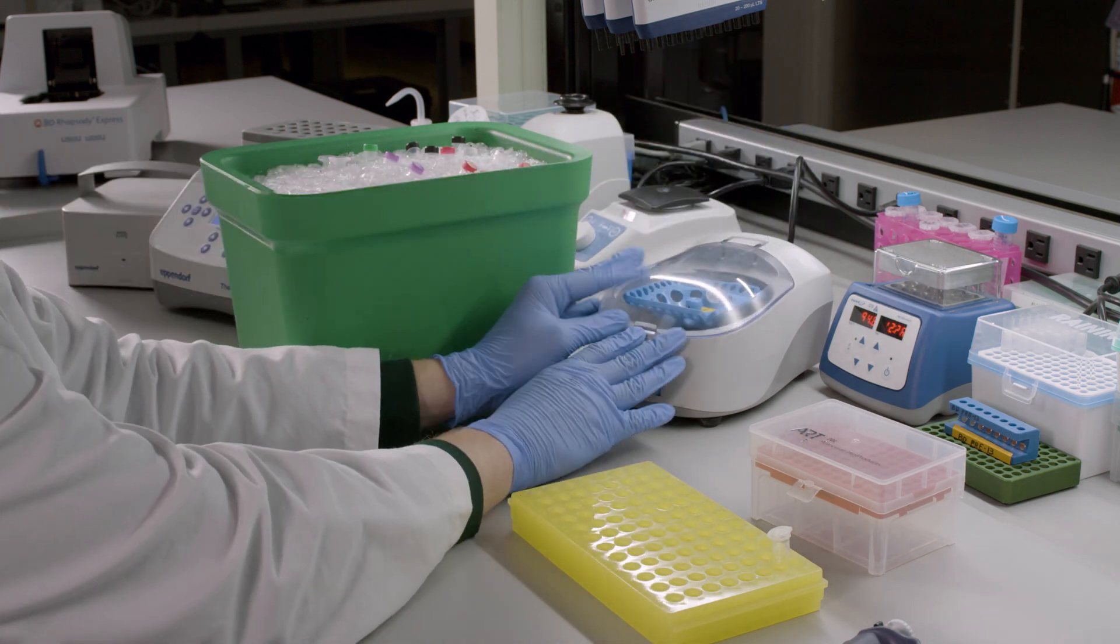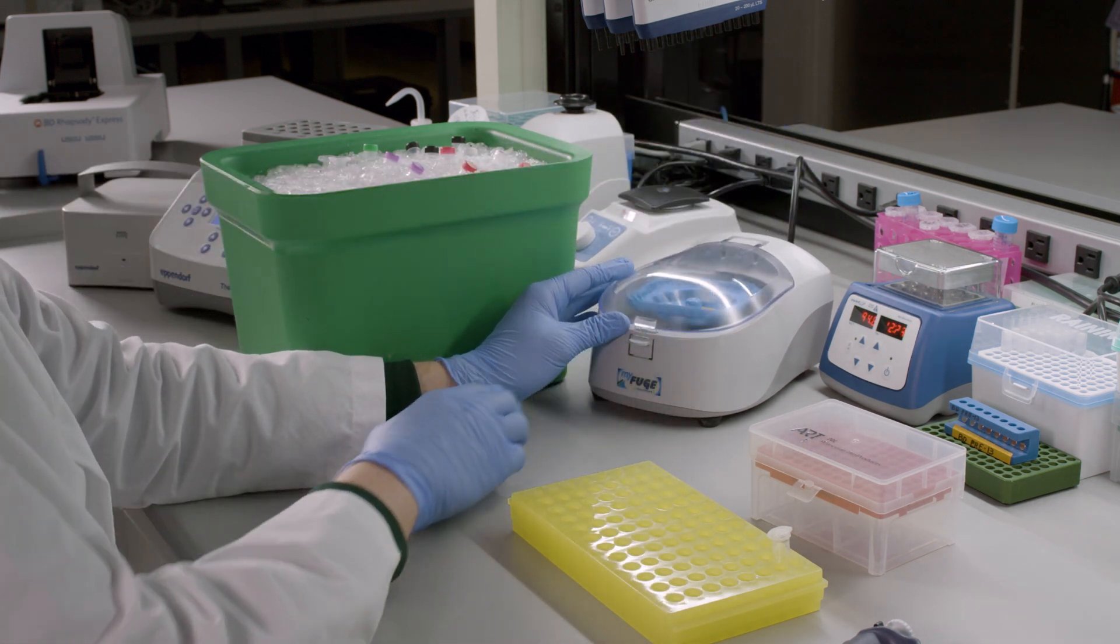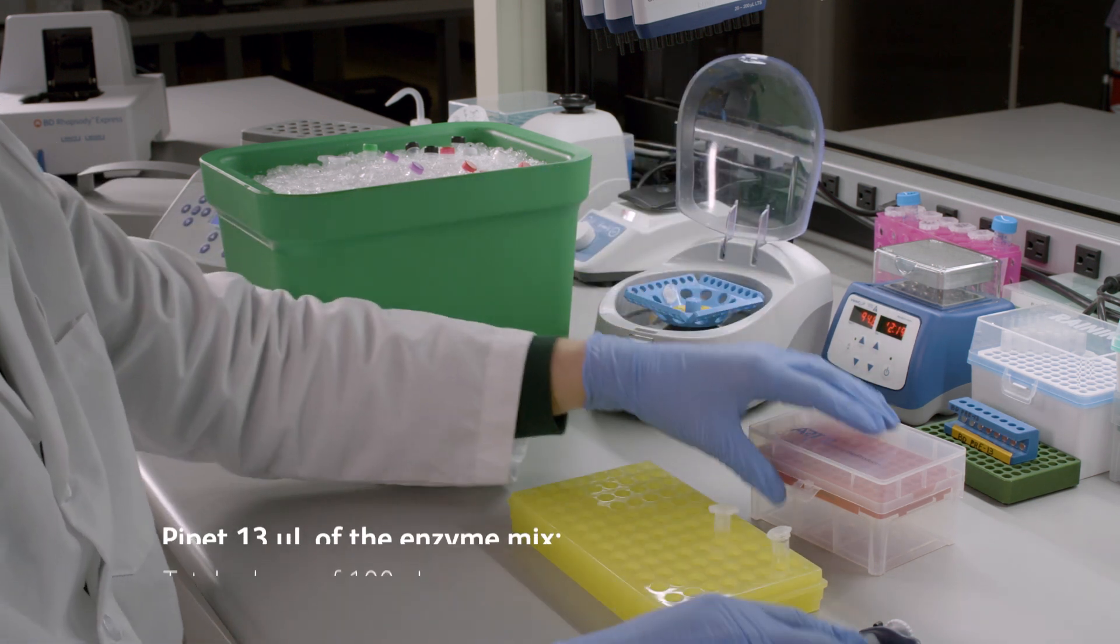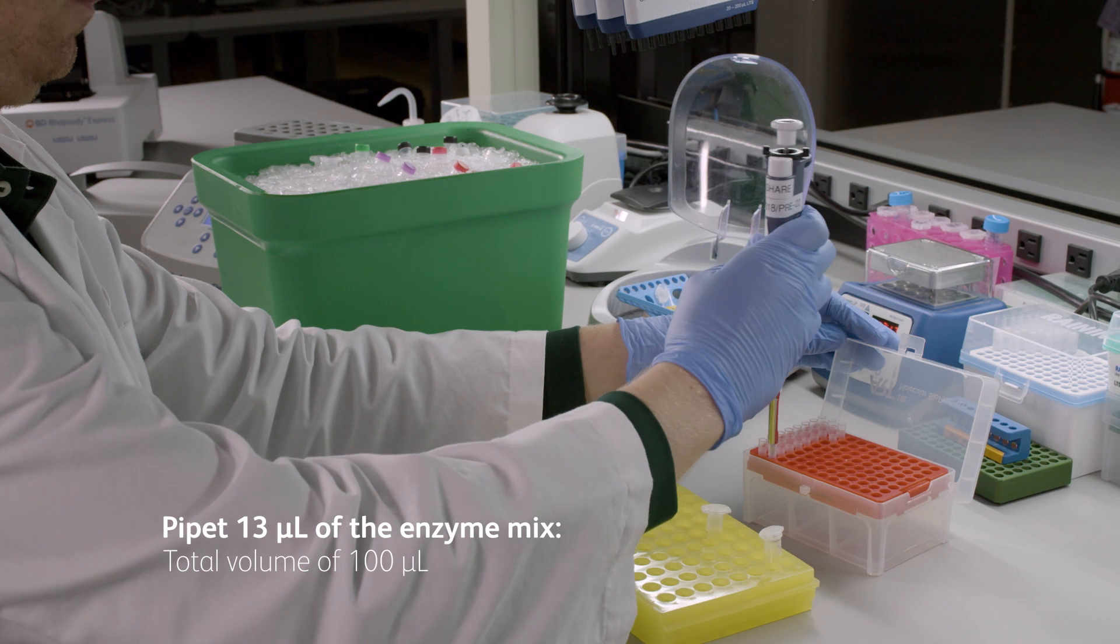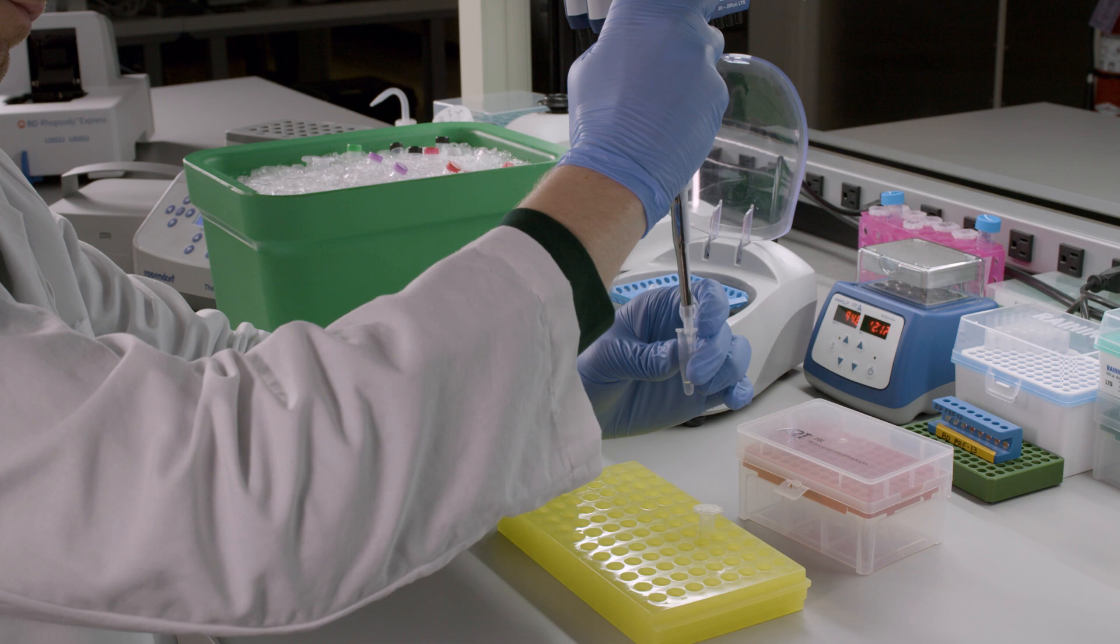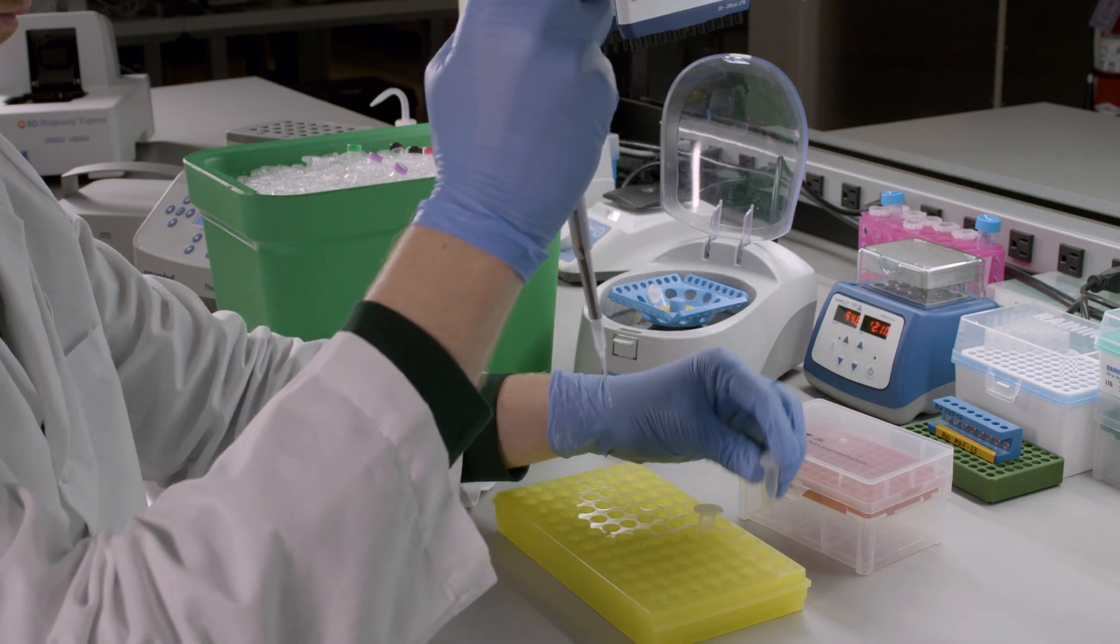After the final incubation step, briefly centrifuge the tube while keeping it at room temperature. Then, take the tube and pipette 13 microliters of the enzyme mix for a total volume of 100 microliters. Keep this tube at room temperature until you are ready for the next step.